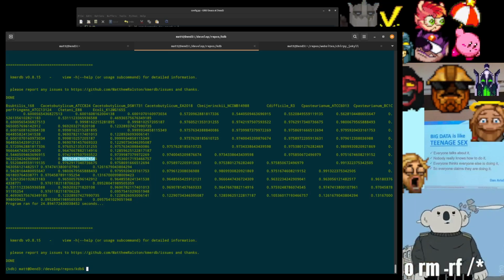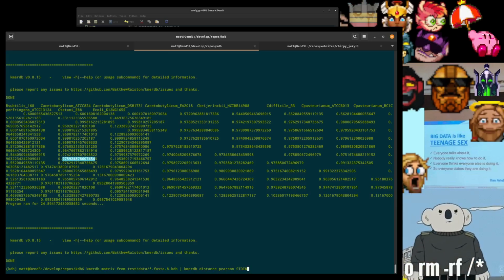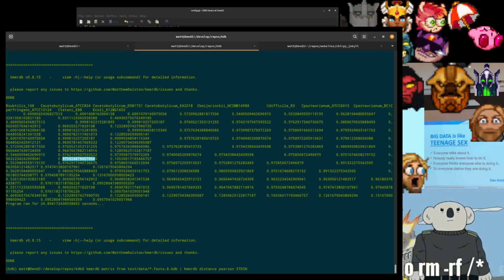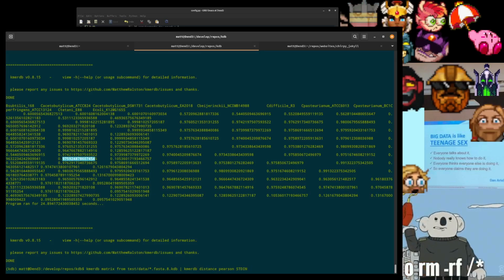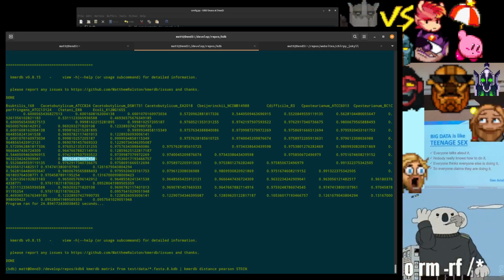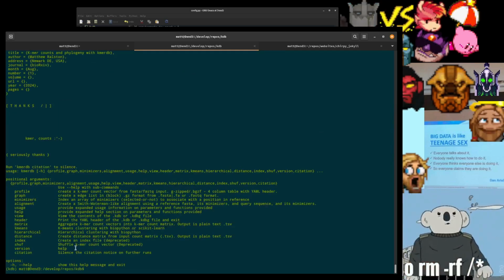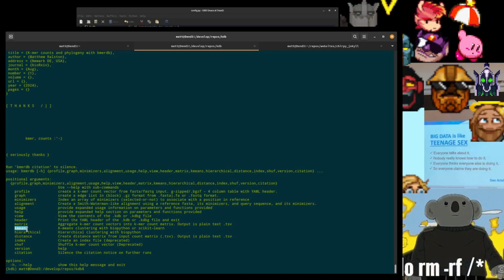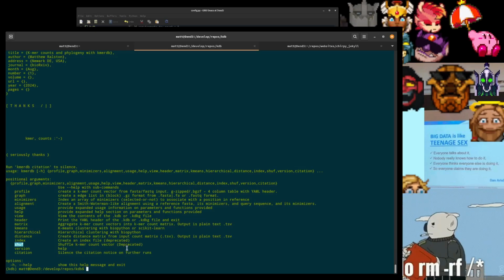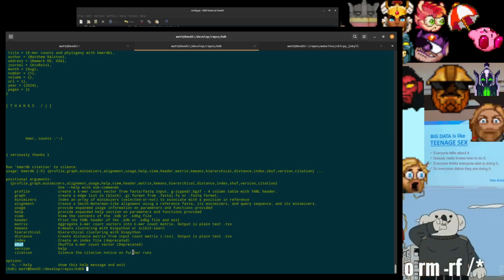So that is piping a count table, aggregating from the count vectors, producing the count matrix, piping that to the Pearson correlation coefficient, and using standard in to accept that input and producing a correlation matrix. There's other functions in here. Hierarchical clustering, k-means. At some point I'd like to revisit this, shuffling the k-mer count vector to take a look at the noise.